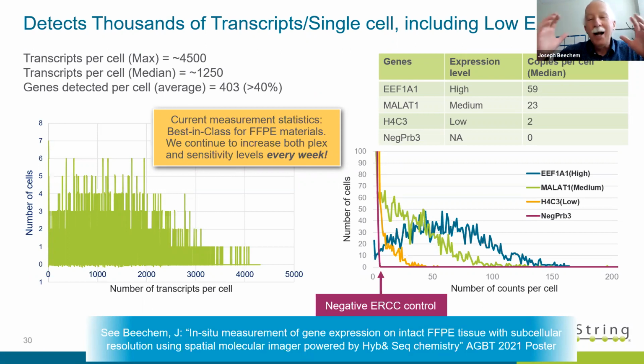They're absolutely essential, I think, for actually knowing what your real backgrounds are. So you guys, probably in the RNA-seq business, are familiar with these ERCC controls. These are sequences that don't exist inside human bodies on planet Earth anyway. So inside our assays, we always have these ERCC negative controls. The sequencing barcodes are going to bind to those things and recognize them, but it just turns out that those sets of sequences aren't in humans. It's really useful because then you get an idea of what your real assay-dependent backgrounds are.